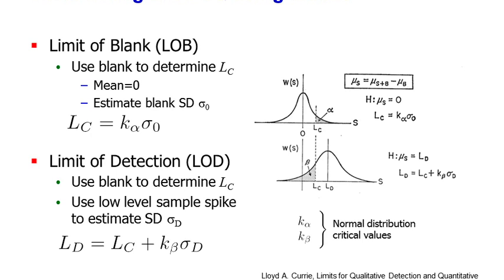Does that answer? Yeah. So is this at specifically the retention time of your analyte, or is it across the entire? No, this is for a specific analyte. So a specific peptide or even a specific transition. So that is at a specific retention time. And if you are measuring 10 peptides and 3 transitions for each peptide, you would have 30 measurements overall, and you would do this calculation for each one of the 30. So that's what Quazar does actually. For every transition, it goes and does all these calculations.